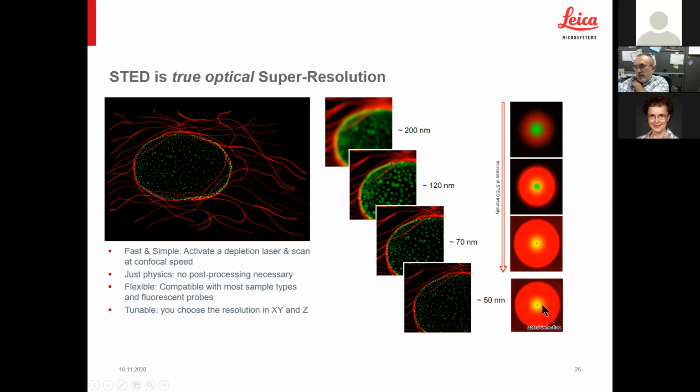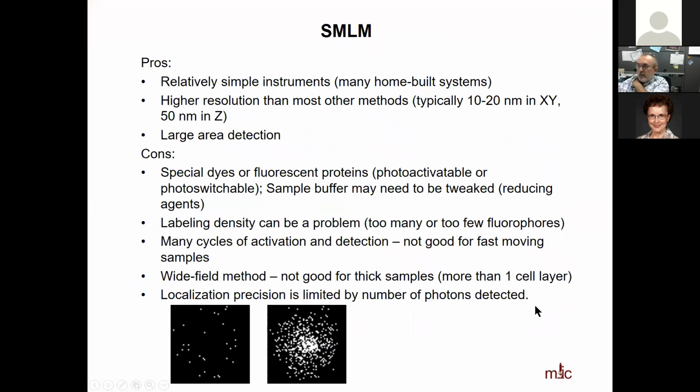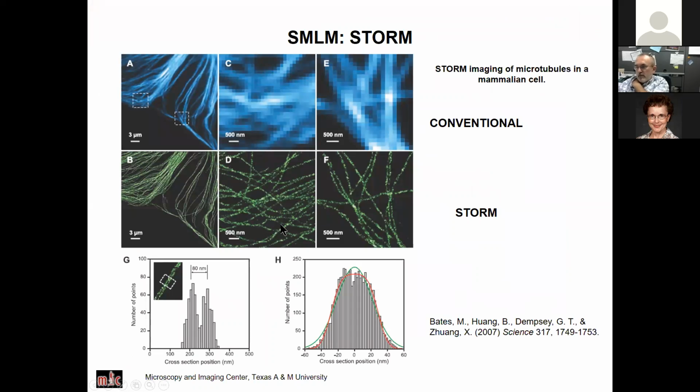Yeah, because if I can excite some fluorophore and then deplete most of it, then it doesn't matter if I only detect just a few photons, as long as the background is very low. But the problem is that this whole scheme requires you to initially excite a lot of molecules. So that's your single molecule localization microscopy.